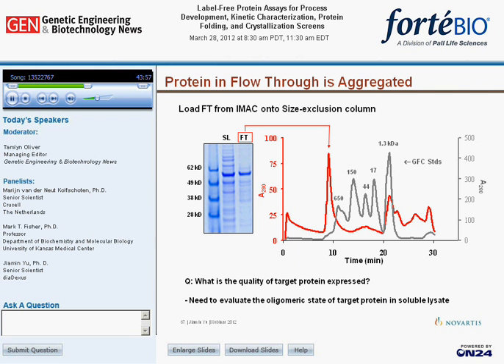We then implemented methods to look at the ratio of the aggregated to monomeric protein in soluble lysate using analytical sizing chromatography and electrochemiluminescence-based immunoassay from Meso Scale Discovery. This was a very labor-intensive process, but it got the job done. When we finally started to focus on constructs overexpressing a high percentage of monomeric protein, not necessarily high soluble expression, we immediately had a success. Those proteins were easy to work with and behaved very nicely during purification.